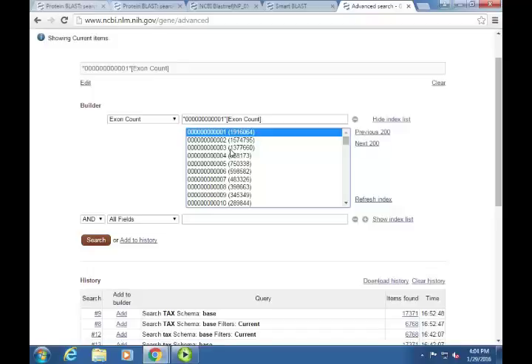Yeah, so this is the gene, right? Yep, that's your sequence, that's your protein sequence. So if I want to blast from here? If you want to blast from here, you can go up to the top, and there's a run BLAST link. And it's looking at it. See, this is your reference sequence, and this tells you which amino acids you're looking at for the sequence. Okay.